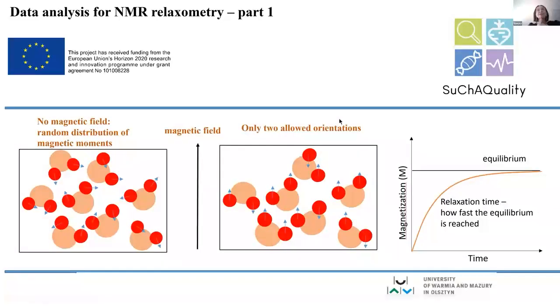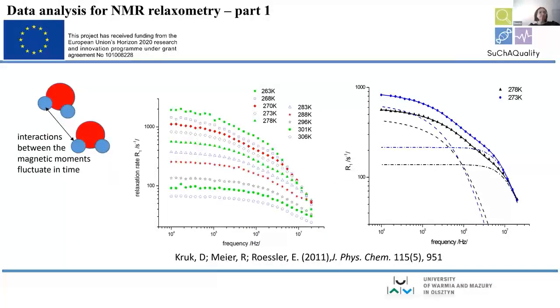And this something, the other NMR active nuclei in the surrounding, and the collection of the nuclei is called lattice. Therefore, spin lattice. Spin is actually a quantum mechanical quantity to which the magnetic moment is proportional. So spin of this nucleus exchanges energy with other neighboring nuclei, forming the lattice. So therefore, spin lattice. Yes. Now, how does this exchange of energy take place?